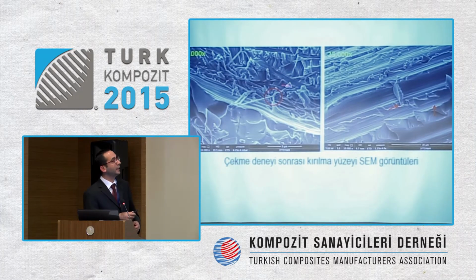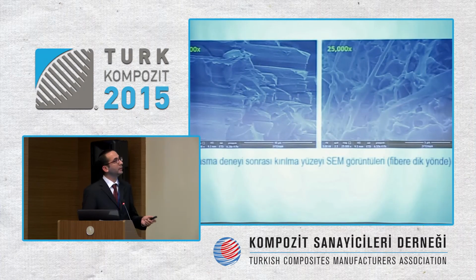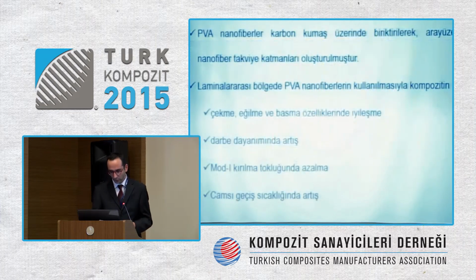And the surface, the epoxy and its plastic deformation, the hackle formation, and epoxy matrix high deformation is the reason for the hackles. And here again, after the press test, you can see the vertical images. The nanofibers are in the epoxy material, and the results of this study can be summarized as such.